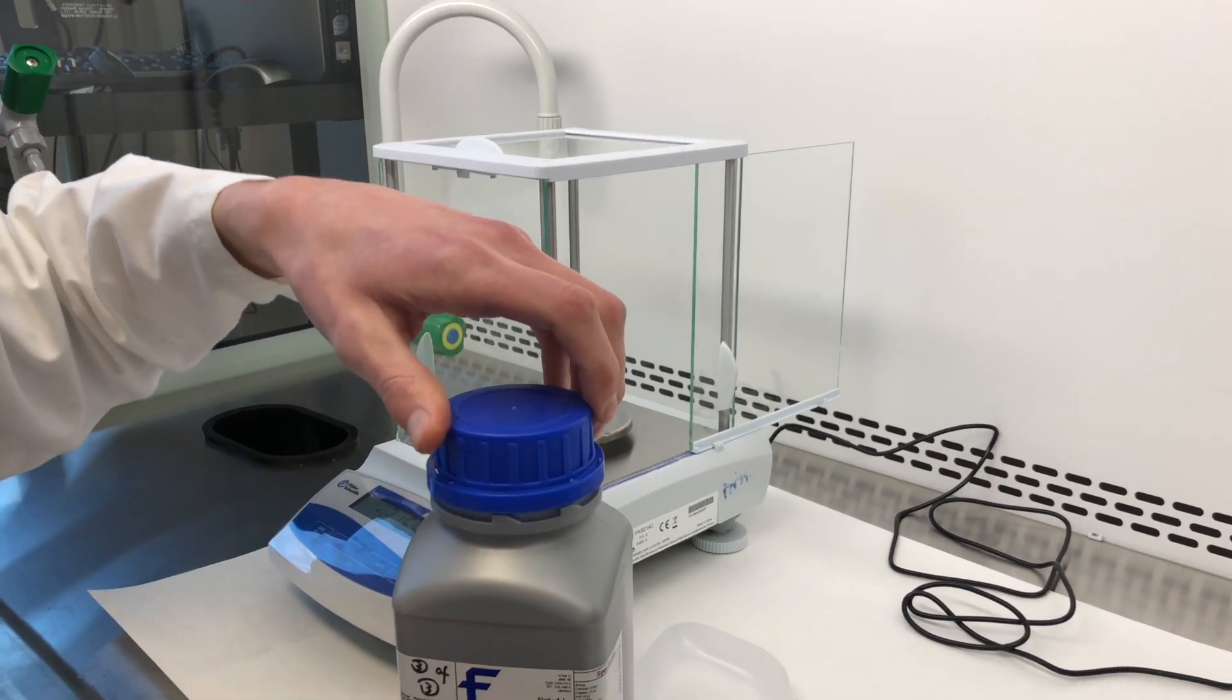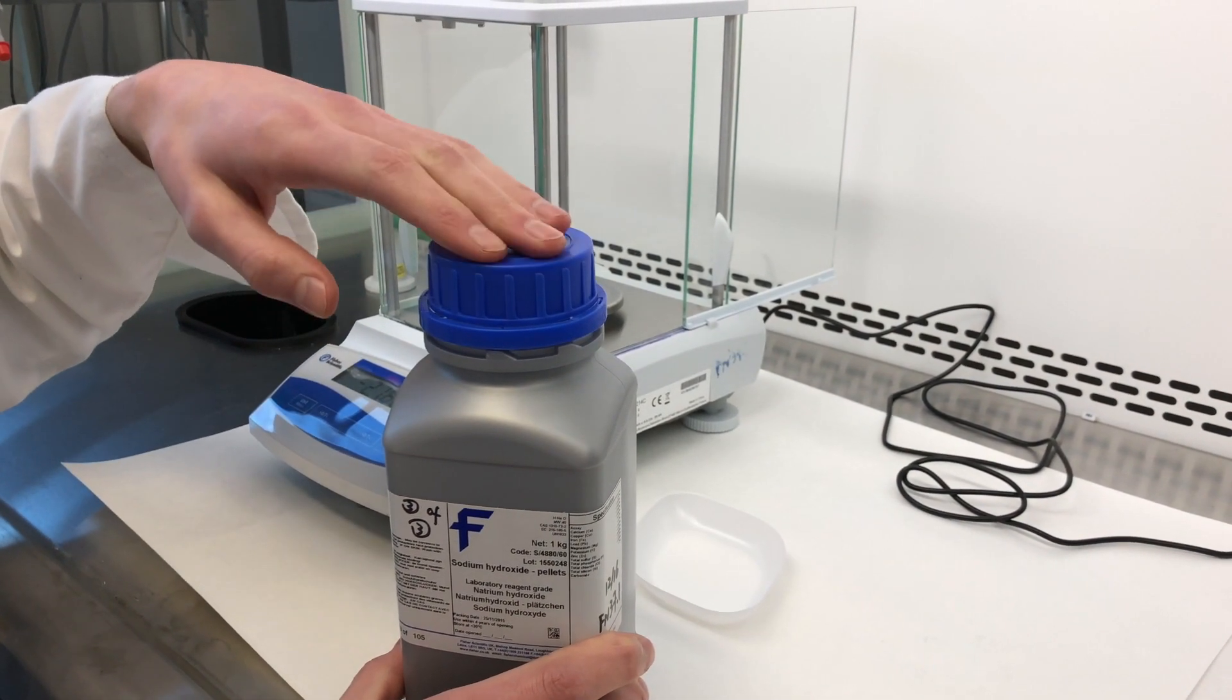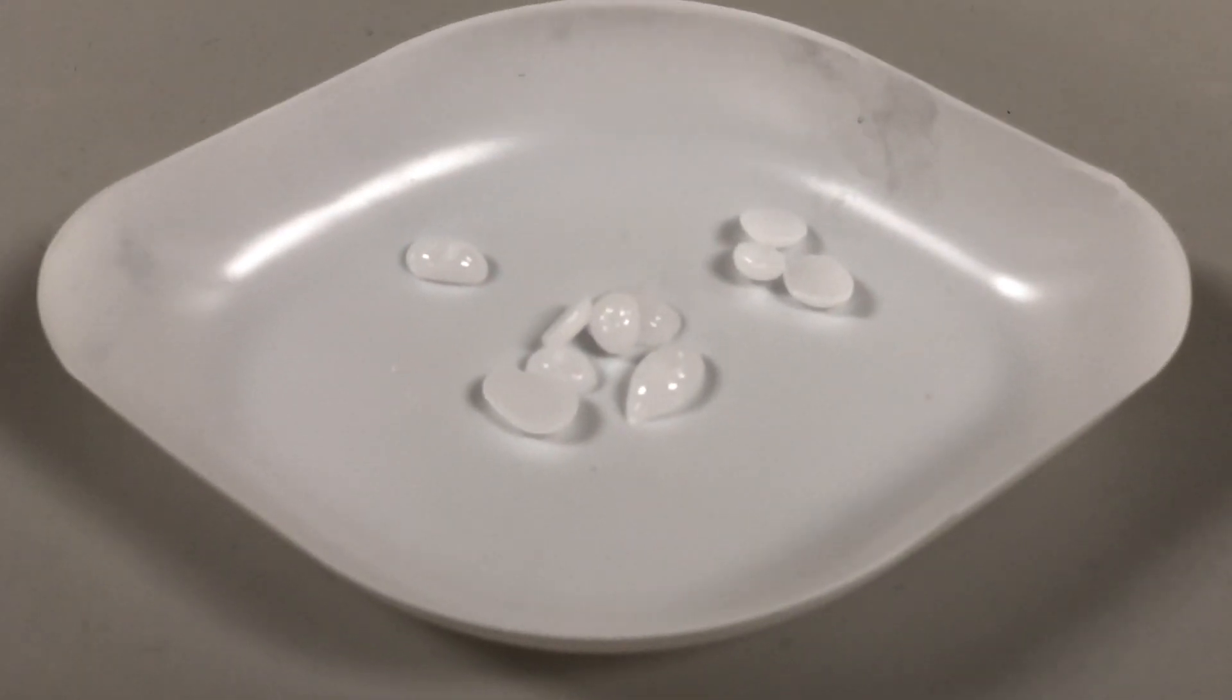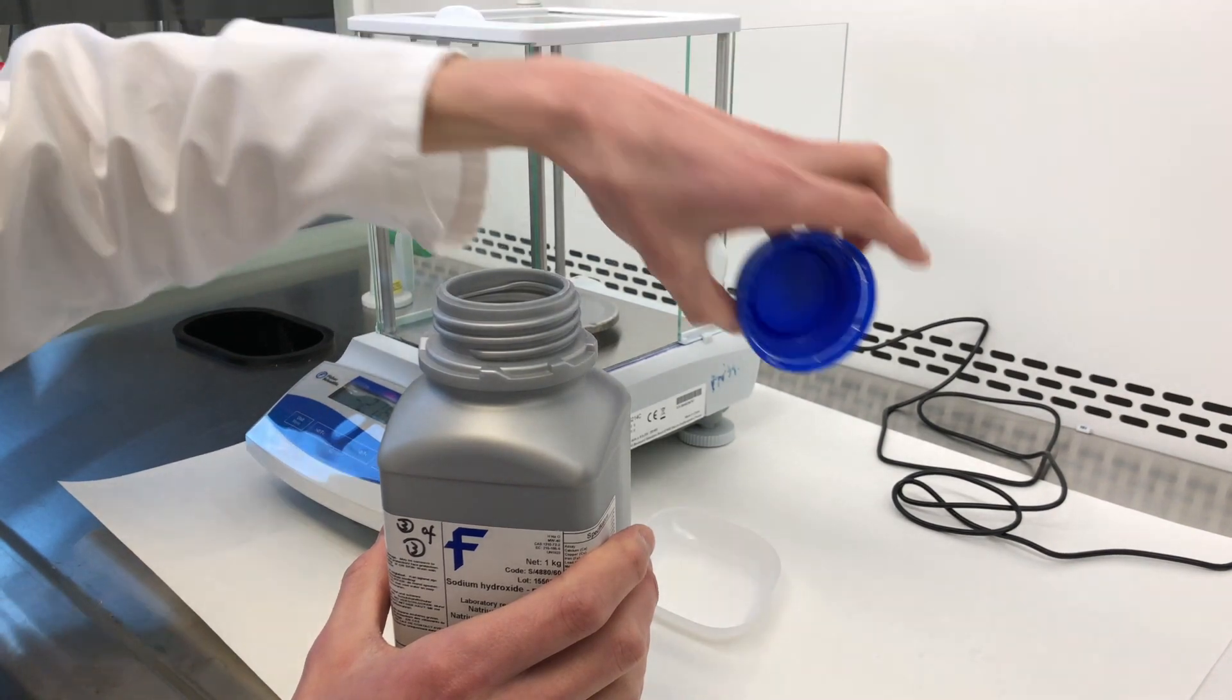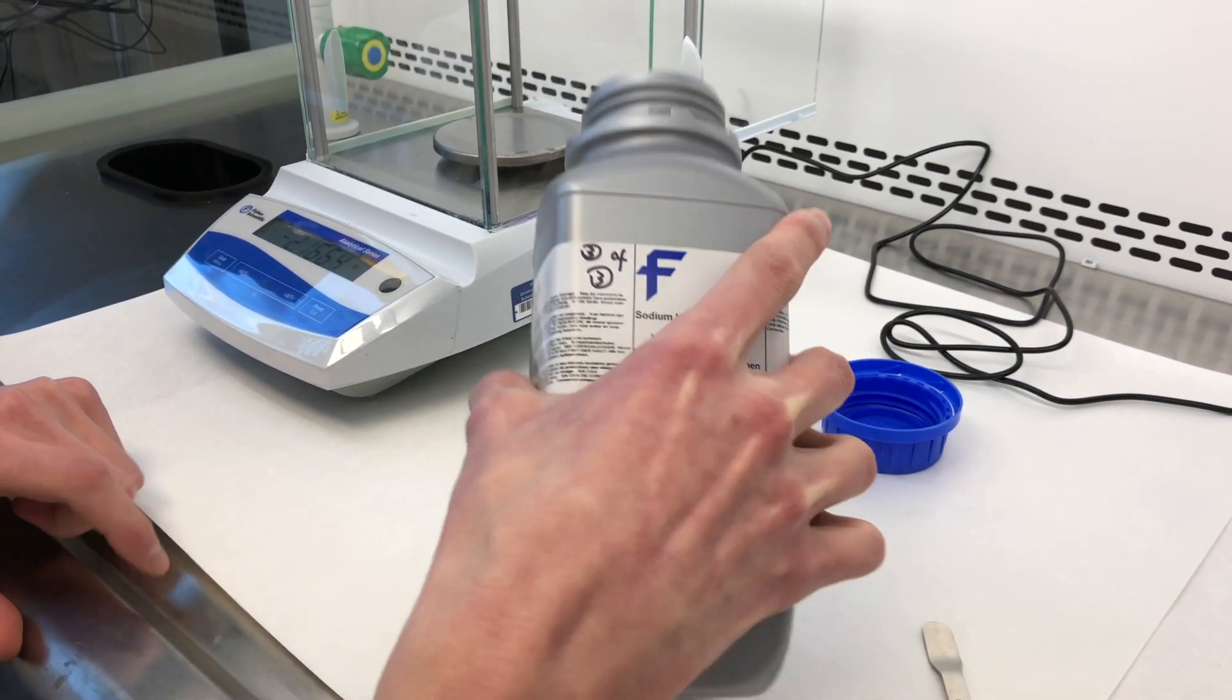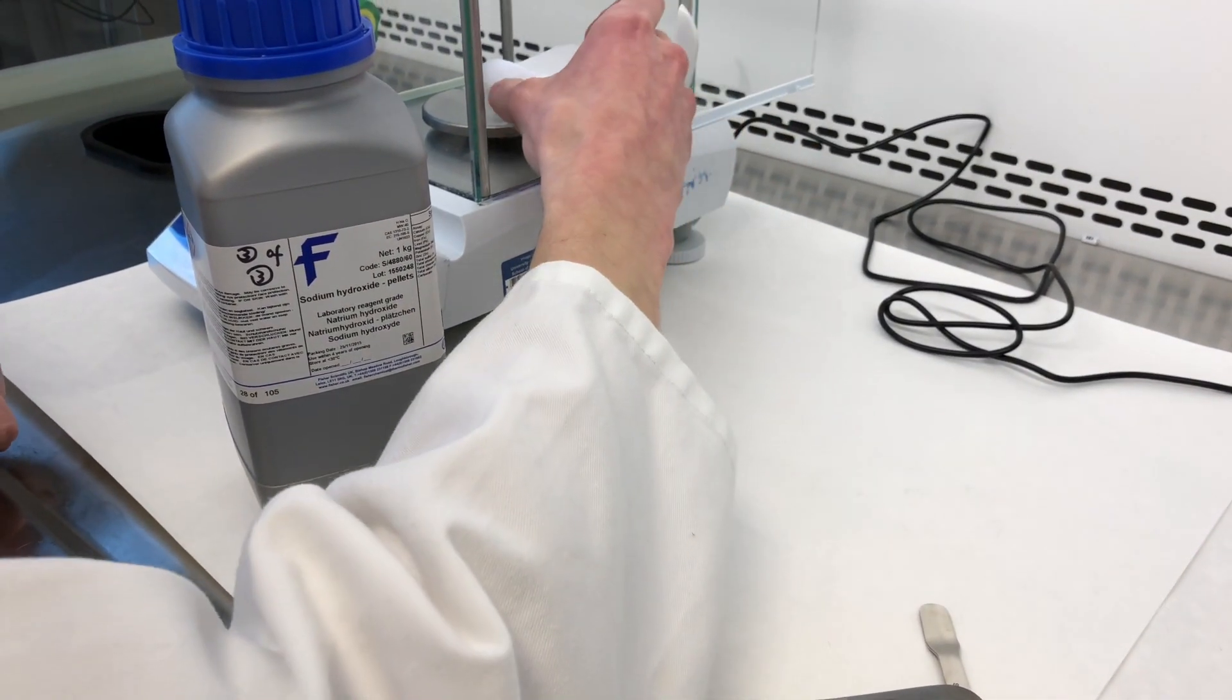One of the properties of sodium hydroxide is that it's hygroscopic and deliquescent. So as soon as you open up the container, it will start absorbing moisture from the air. Taking a look at the sodium hydroxide pellets here, you can see that they're slightly shiny. That is because they are absorbing moisture from the air. So this procedure needs to be done quite quickly.